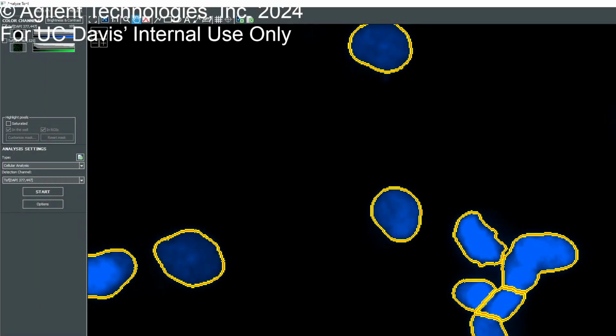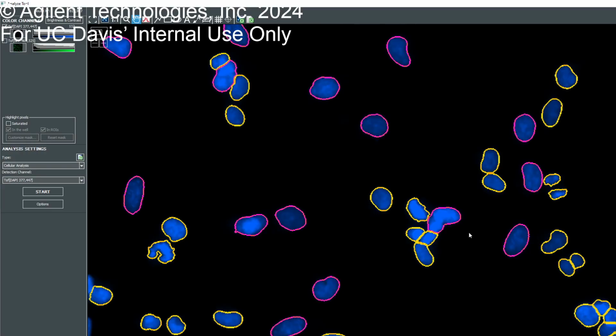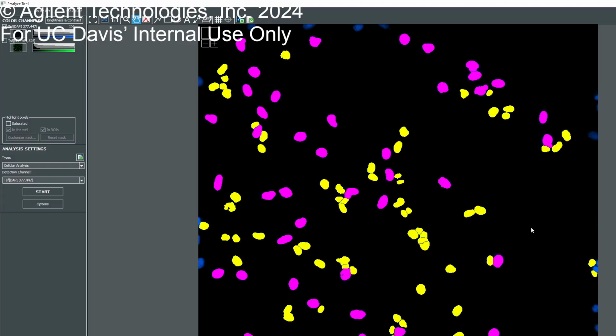So if you go back and if you go to the all objects button, you have the subpopulation that are like larger cells. You can also fill objects, and now it's like very distinctly different. So when you select a population like that, you will then highlight them here. Yeah. That's really cool. Yeah, I guess you do this stuff manually.